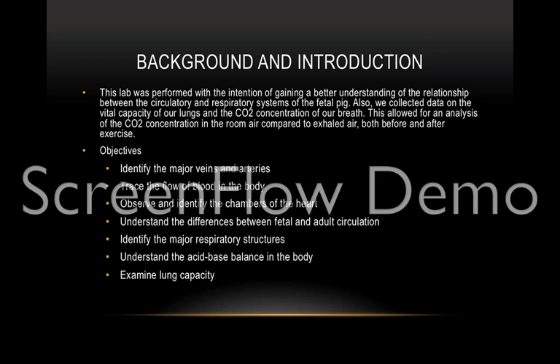This lab was performed with the intention of gaining a better understanding of the relationship between the circulatory and respiratory systems of the fetal pig. Also, we collected data on the vital capacity of our lungs and the carbon dioxide concentration of our breath. This allowed for an analysis of the carbon dioxide concentration in the room air compared to exhaled air, both before and after exercise. The objectives cover what we will learn or identify during the fetal pig dissection, as well as what we will learn during the experiments of vital capacity and carbon dioxide concentration.